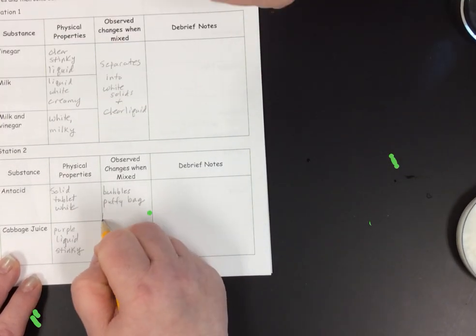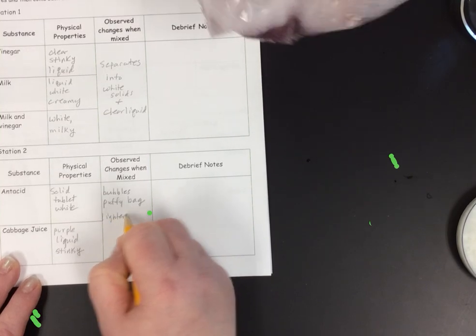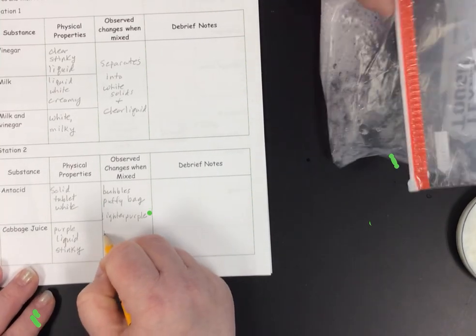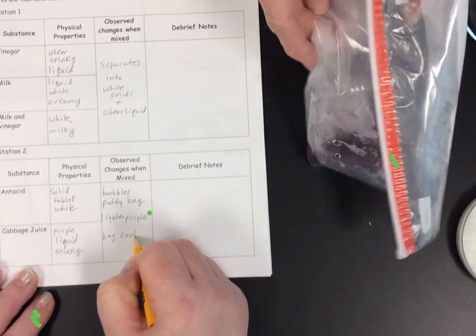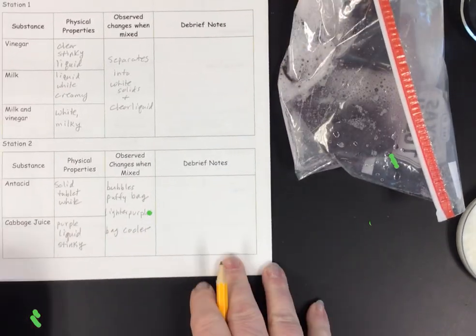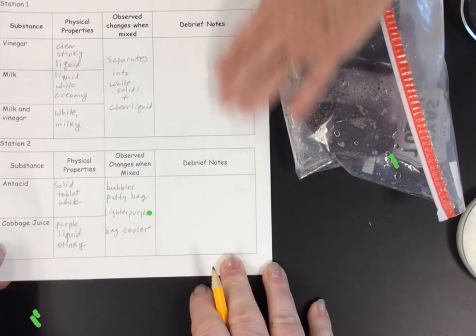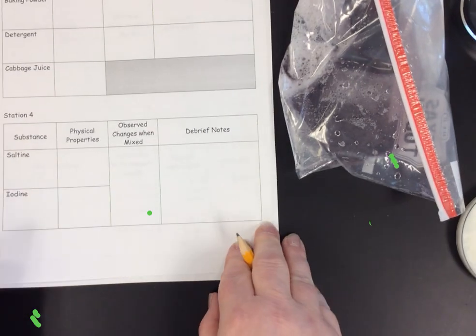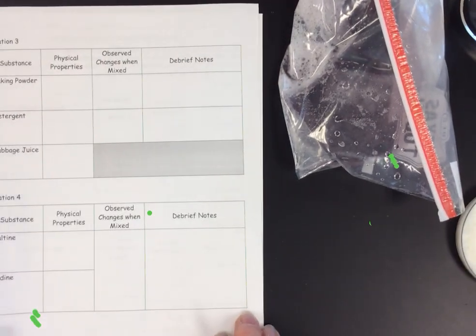So the observed changes: the bag is puffy, there are bubbles in the liquid, there's still some purple but it did get lighter, and the bag got cooler. Those are all things that you need to write into your observations. We'll talk about debrief notes later. We don't need those for this particular lab.